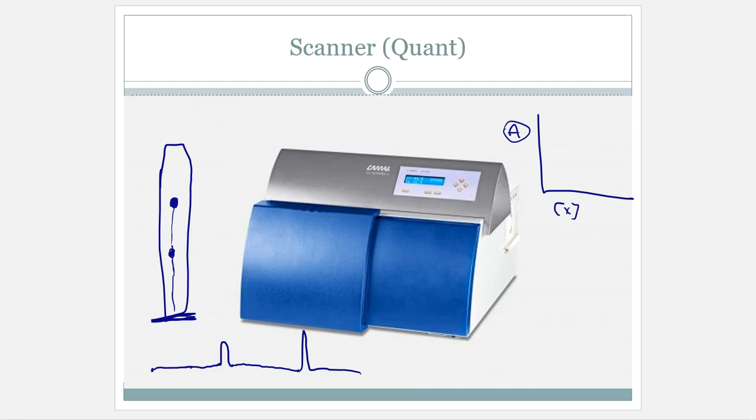We know now the absorbances from the densitometer, and we can plot those absorbances from the scanner onto the graph, and we can build this regression line. So this is the way that we quantify data. We treat it no differently than any of the other instrumentation methods that we have used at this moment. It's just, again, a different new way of quantifying on HPTLC.